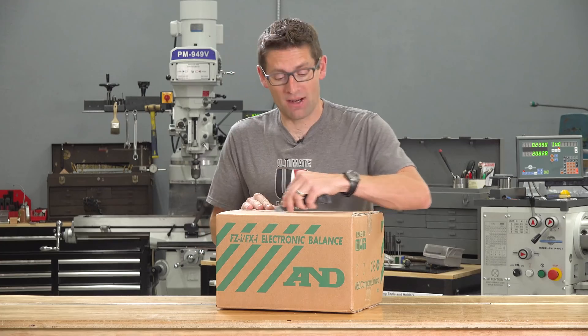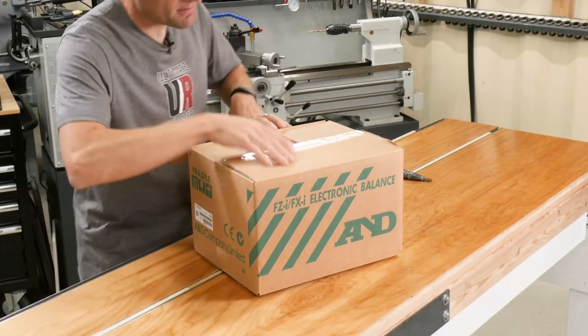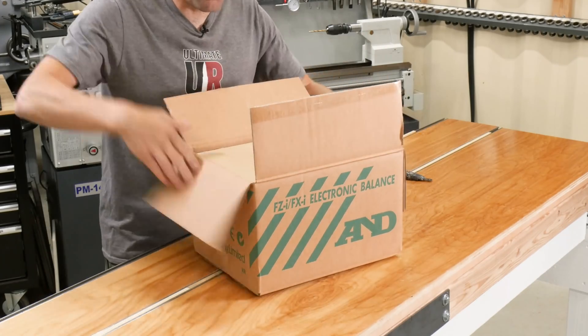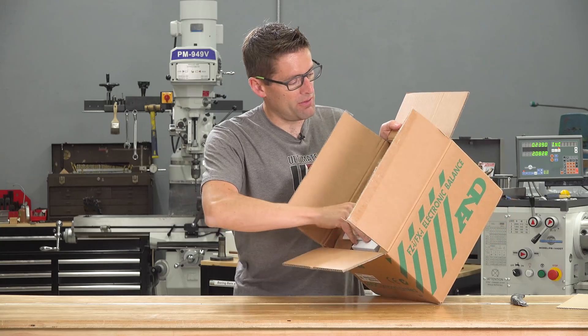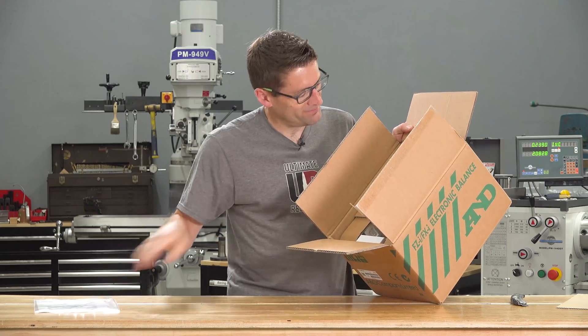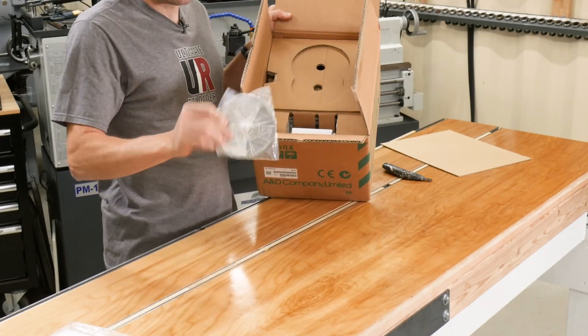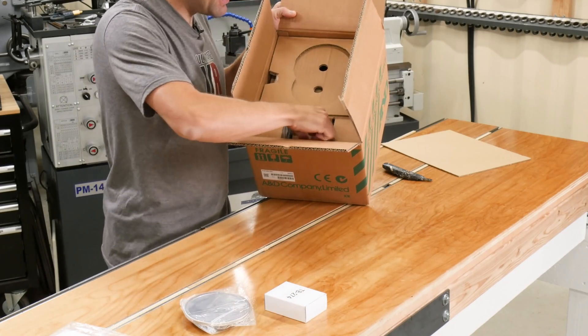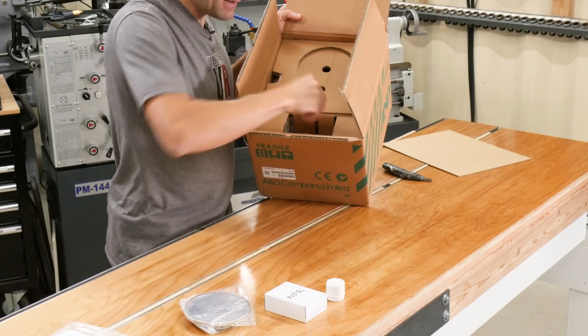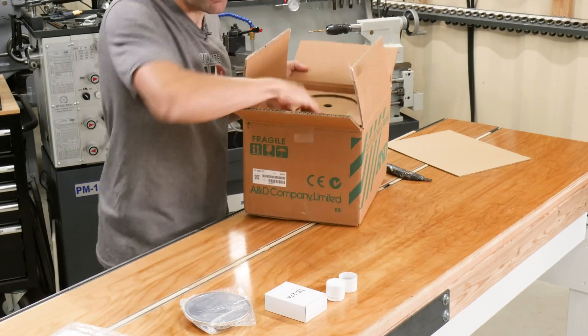I have not even had a look in here. I kind of like to do this, take my first look with you all. So here we go. Literature, the top plate, got the box there. Calibration weight, looks like the cap came off of that.